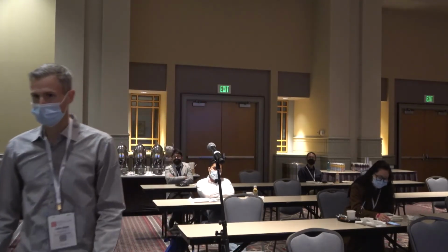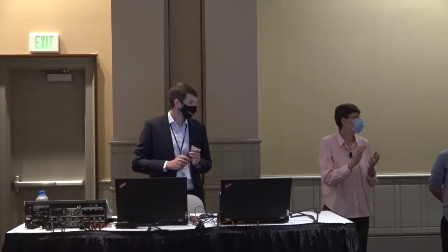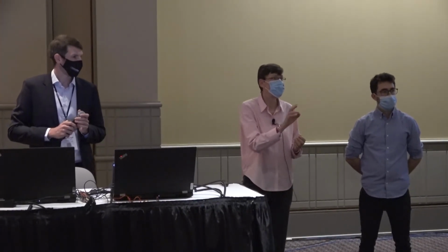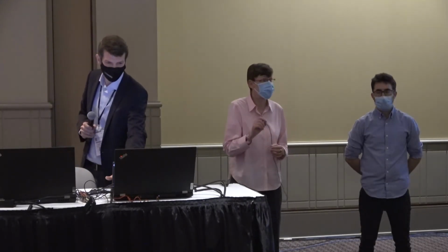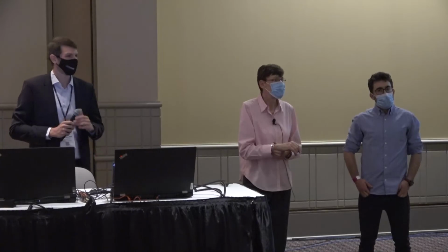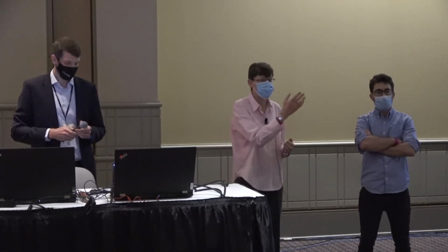Well, you're right, it's a challenge, because often in the wild type, there's just nothing. So we have to really see that we integrate something. And we have used the Q-value sparse in order to do this, and that has been quite nice. We also check that it then actually integrates in the correct space. With the DIA Direct, it has a predicted retention time and then would integrate there. We also tested a few outside software packages, and often we cross-check them. But we think in Spectronaut the algorithms and defaults are quite nice, and that has worked for us. But you're right, that's a definite challenge.